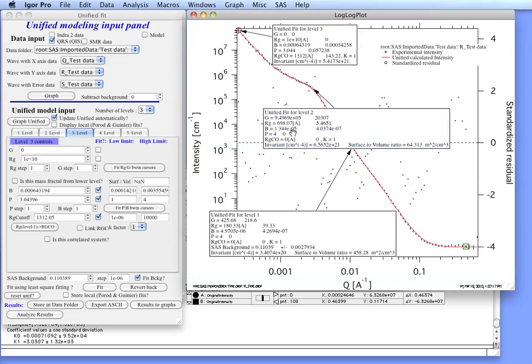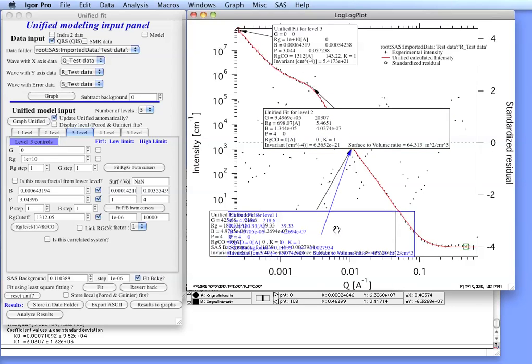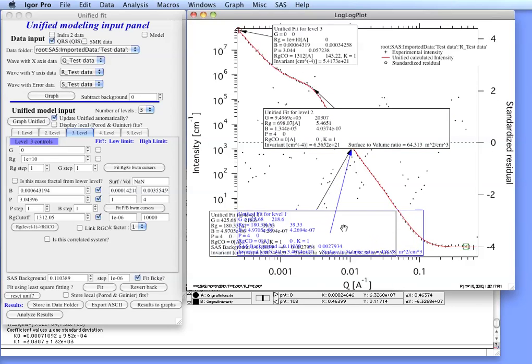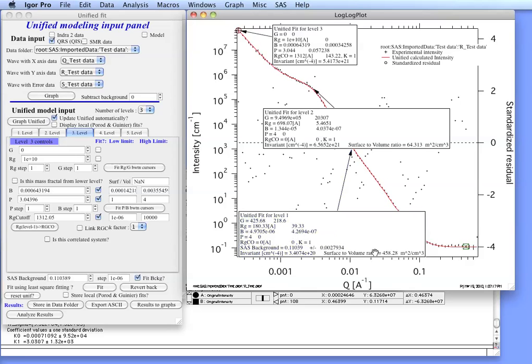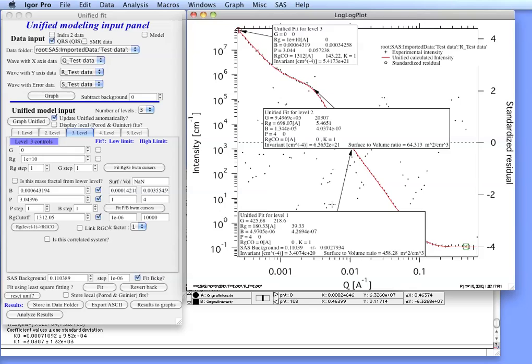Here you have another similar result for the large features. Now the surface to volume ratio is actually independent of absolute calibration because it is using the invariant and the B, and the volume therefore cancels out of it. Some of the other results I will be showing in the next few minutes depend on absolute calibration of your intensity. So this is the first primary set of results from the unified.